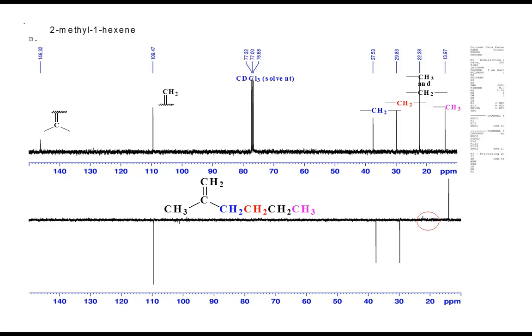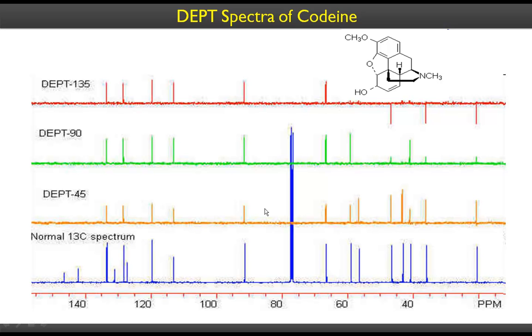Anyhow, that's a pretty controversial spectrum, because if this is a methyl, then we should have one CH2 somewhere. That should be going downwards, right? That's wrong. So this is probably a simulated NMR, right? We have two methyls, so those methyls are fine, and this is overlapping. I do understand that, but when you run the DEPT NMR, you should see something going down, because that overlapping doesn't affect the CH2s. CH2s are still there.